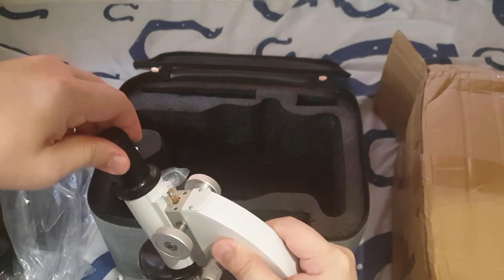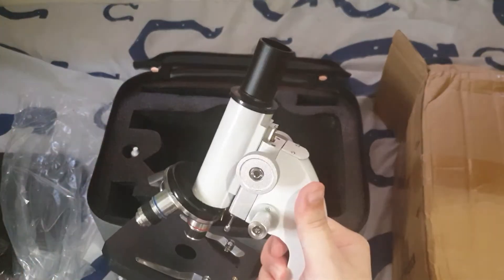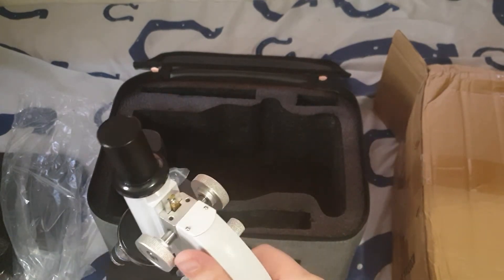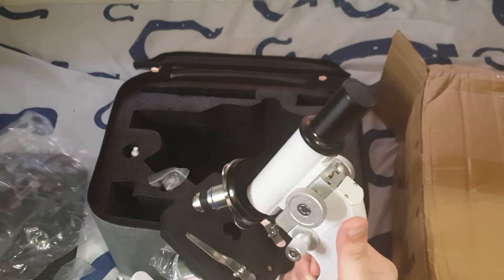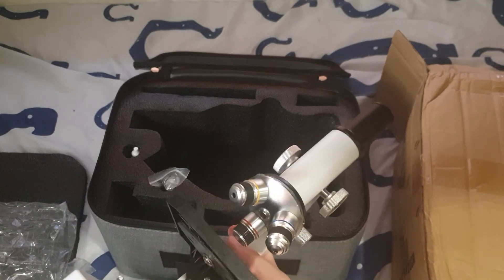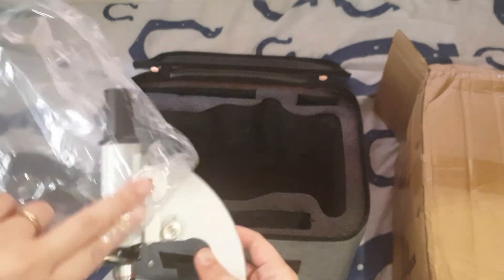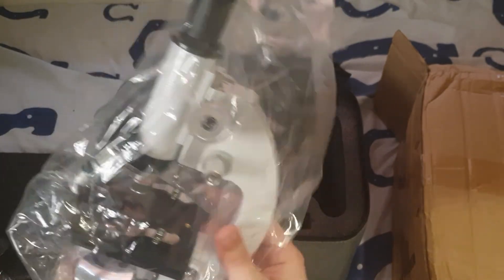I'm trying to figure out how to open up the — there you go. Expect to see more — I'm going to open up another channel for microscopy, so stay tuned for that. It's a basic microscope, the kind you're used to in school. It's definitely a cheap one. I'm wondering how good the optics are — maybe I'll make a follow-up on how good it is. This is just basically an unboxing; I'll definitely organize all the stuff and see what this thing is capable of, so stay tuned.